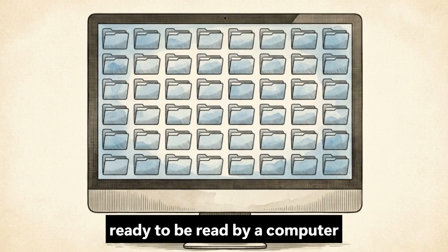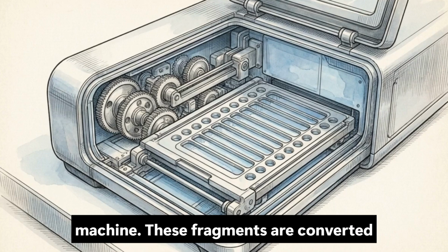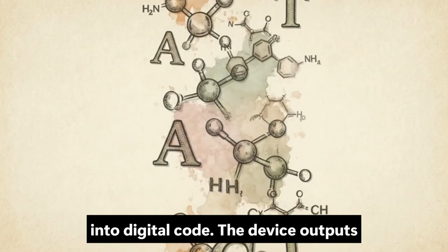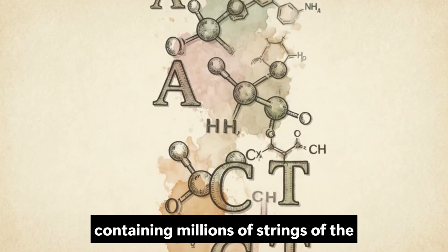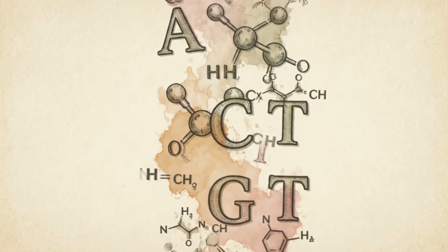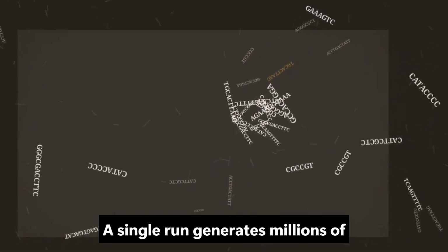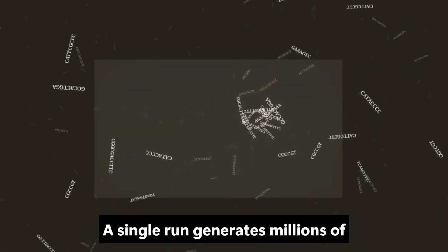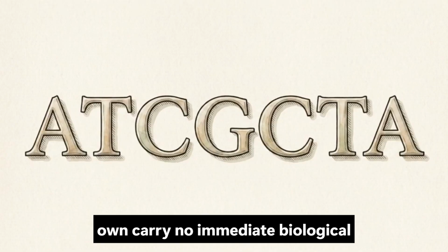The biological sample is now effectively a digitized chemical library, ready to be read by a computer. Inside a next-generation sequencing machine, these fragments are converted into digital code. The device outputs massive text files, known as FASTQ files, containing millions of strings of the letters A, C, G, and T. The scale of this data is massive. A single run generates millions of disconnected short reads, which on their own carry no immediate biological meaning.